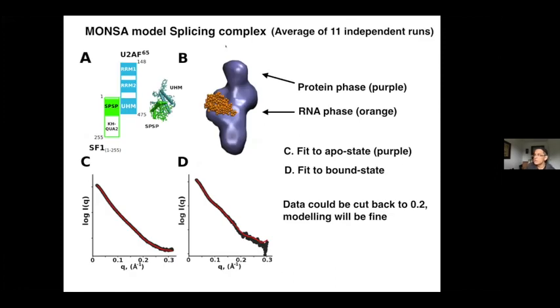So in this case, with this protein-RNA complex, we had data of the complex, of the protein alone, and of the RNA alone. I'm able to model these separately and see that the RNA, the small little RNA, is binding towards the center of mass of the particle. That's a neat way to visualize where the RNA is binding with respect to the protein. I could guess at that because I could see that the Rg shrank a lot when the RNA bound, suggesting that it was binding in the center. But this is, again, a good way to visualize that change.